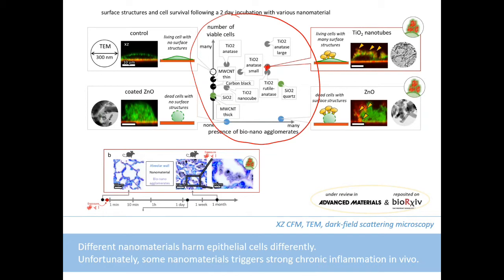Interestingly, if you take a look at the in vivo or ex vivo samples, you can identify similar structures. This is inverted color from CytoViva images, so as not to be too similar to fluorescence images. Here the black color is now the inverse of pure white. The black dots are nanomaterial because it scatters light at all wavelengths everywhere.